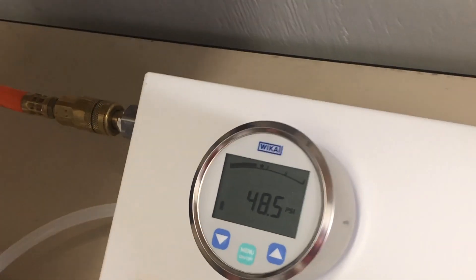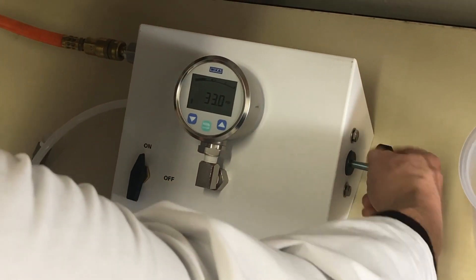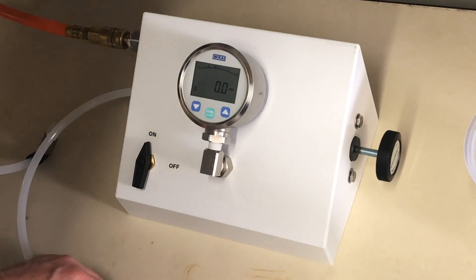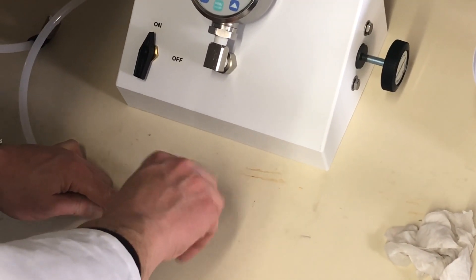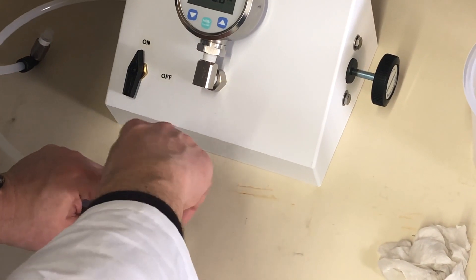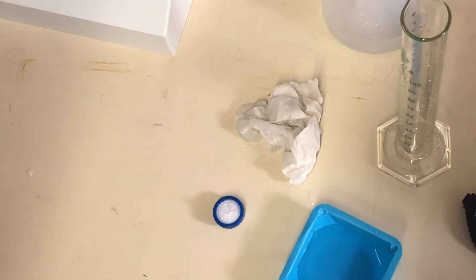You would now record the bubble point and then release the pressure by turning counterclockwise fairly rapidly until the pressure reads zero. Now it's safe to remove the filter from the outlet fitting by screwing counterclockwise — you have to hold the fitting while you untwist it. This filter is now tested. We'll save that if we want to do any further examination on it.